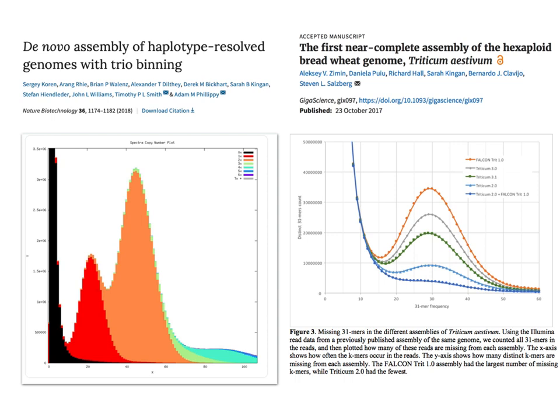Now, what you can see is the content recovery here is quite good, and the partitioning is quite good. You can see that everything is pretty much recovered. The first peak appears once in the assembly, the one in red color. The second, the homozygous peak, appears basically twice, and so on and so forth. So that's a very nice result indeed.